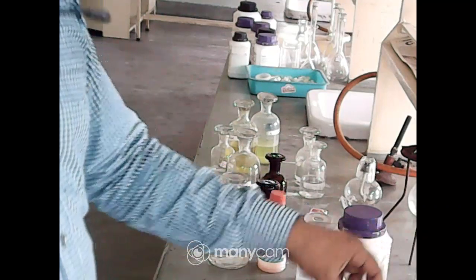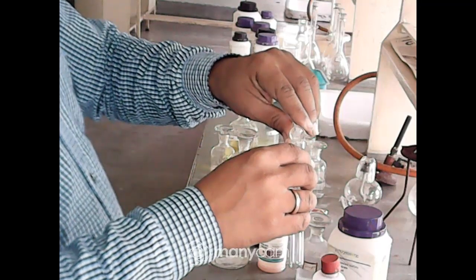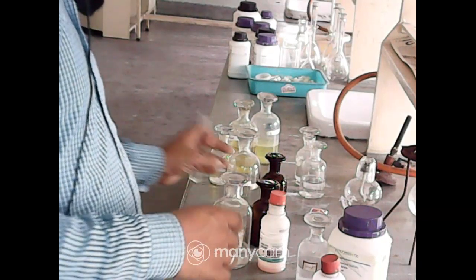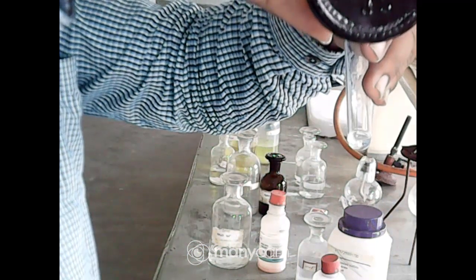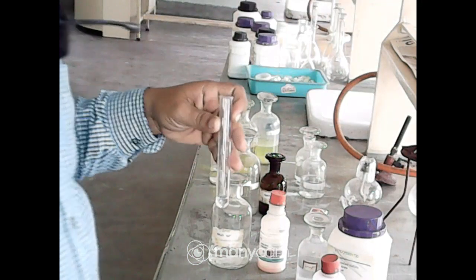Now we will go for the test for anion. So for the test for anion, first we have to go for chloride. The reagent for chloride is silver nitrate. It is available in that particular color of bottle. Okay, this is silver nitrate. If chloride is present, it gives a white PPT. Observe whether any PPT is coming or not. Okay, no PPT is there.